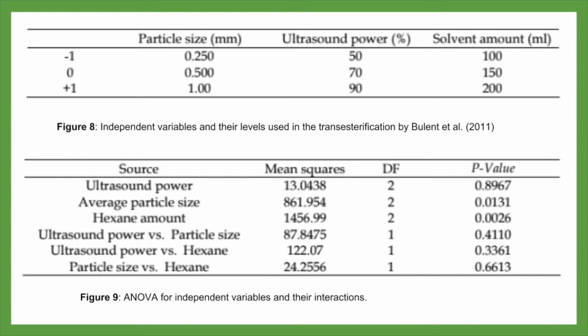The purpose of this proposed experiment is to test for the optimal ratio combination of alcohol and oil and the optimal amount of catalyst that will yield the highest volume of biodiesel through the process of transesterification. It is expected that when a higher ethanol to oil ratio and a lower amount of catalyst is used in the process of transesterification, similar results found in Hossein and McLeod's study 2016 will be seen, where the volume of biodiesel yielded is the highest.